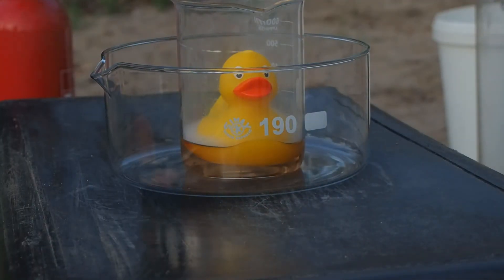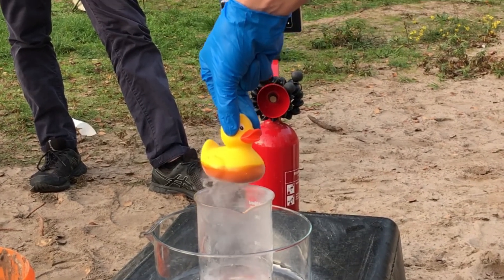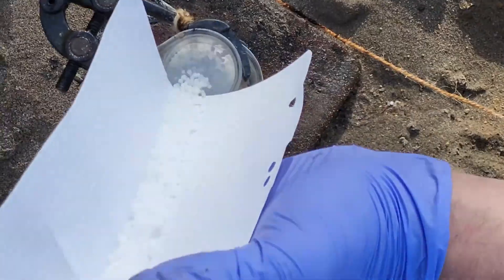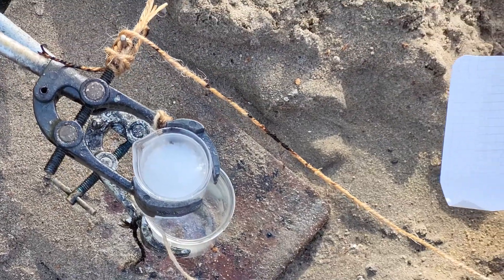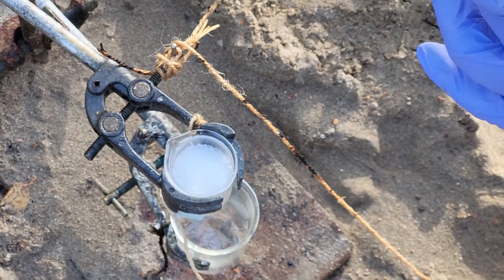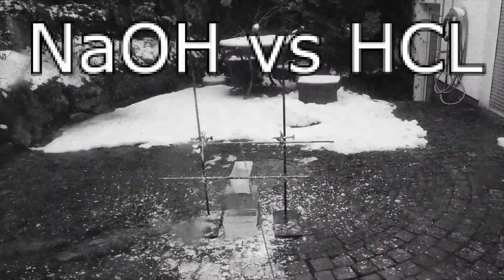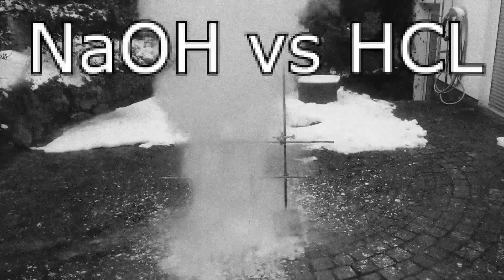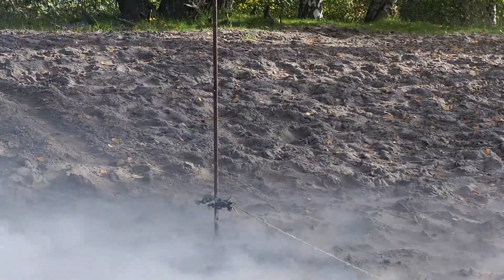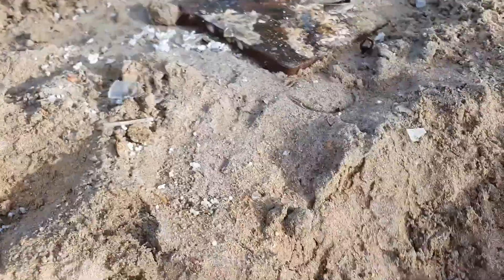The acid isn't able to dissolve all kinds of plastics that quickly, and this cute rubber duck managed to survive the acid besides some minor discolorations quite well. For the last experiments we wanted to show what happens when we mix a super acid with its opposite extreme, the super base. Before that, we first reacted the super acid with a regular strong base using solid sodium hydroxide, which is also used as drain cleaner. It was quite a vigorous reaction but nothing too wild. But dissolving the NaOH in water before the reaction can make it quite a bit more vigorous — and indeed the violence of this reaction was quite unexpected. It was almost a detonation, completely blowing the glass apart. You never know with these kinds of reactions, and that's why we decided not to scale this reaction up.